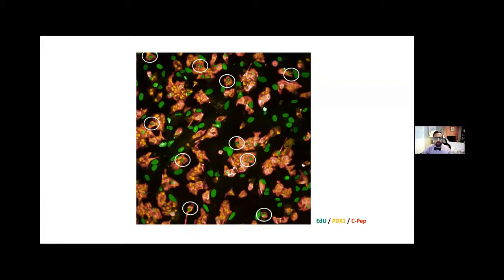That question came from Julia, by the way. Another question that came in the chat is from Sasanka Ramanhan: how long does it take for the cells to attach? This came in at the beginning of the presentation when you were talking about plating and then peeling away some of that. And also, how long were they attached before you did your GSIS study?